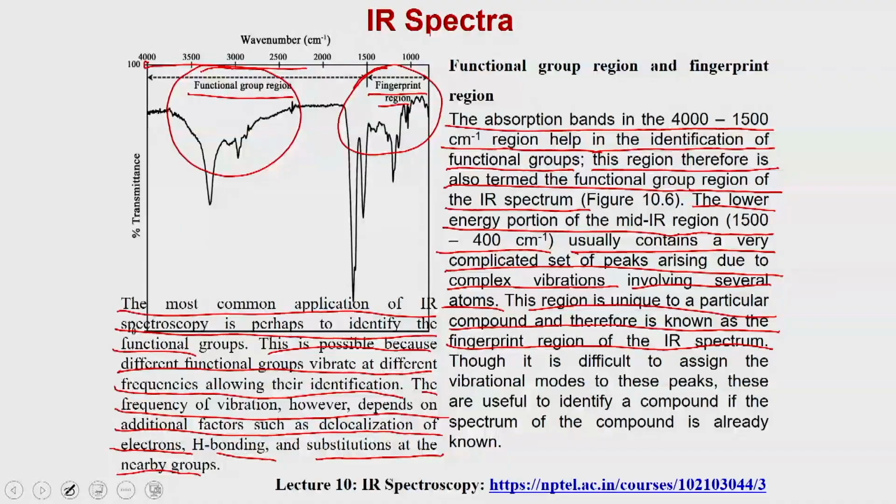Though it is difficult to assign the vibrational modes to these peaks, they are useful to identify a compound if the spectrum of that compound is already known.